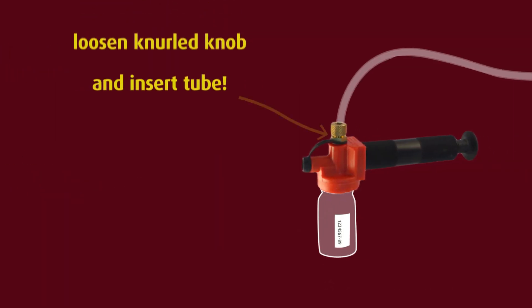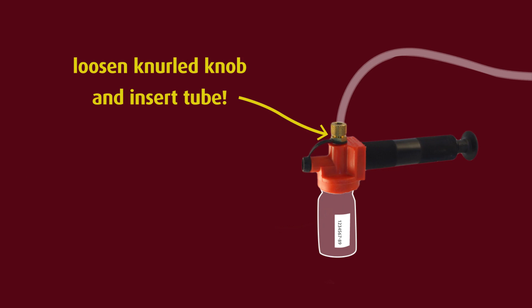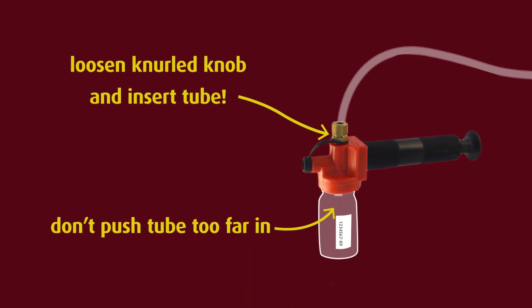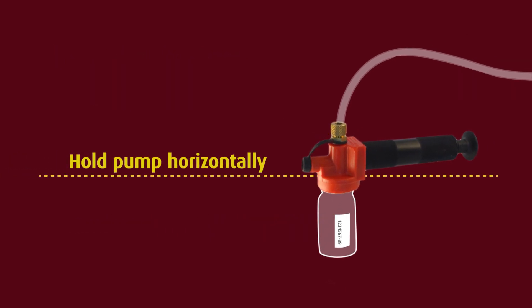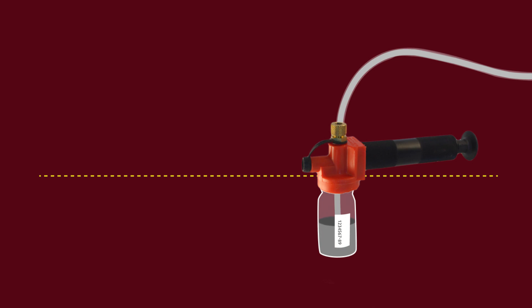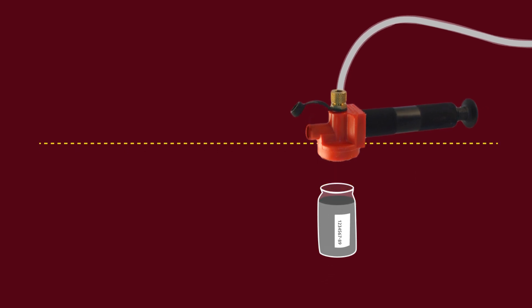When inserting the sample tube into the pump, loosen the knurled knob at the top of the pump and insert the tube through it. Push the tube through until it is just protruding through the base of the pump — if the tube is pushed through too far, it will get covered in oil and the pump will get contaminated when you remove the tube. Hold the pump horizontally when operating it, with the fitted sample bottle pointing straight down; holding the pump at an angle can easily lead to contamination with oil. When using the pump, you will quickly discover that when you stop pumping, it does not mean that the oil stops flowing — the oil will continue to flow as long as there is a vacuum in the system. When the oil is at the correct level, either twist off the sample bottle or pop off the dust cap on the valve at the end of the pump to break the vacuum. Some people leave the dust cap off the whole time and use their finger over the end of the valve to control the vacuum.